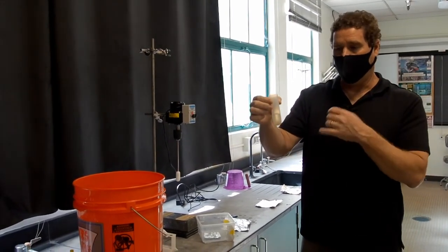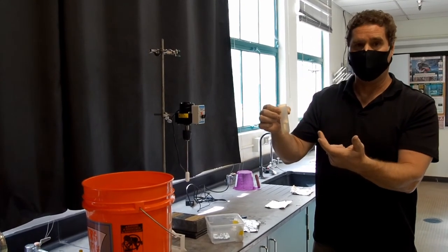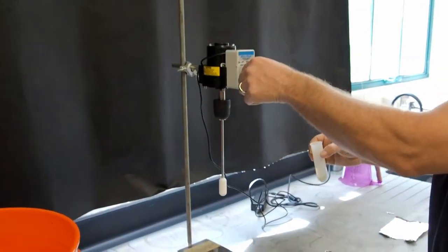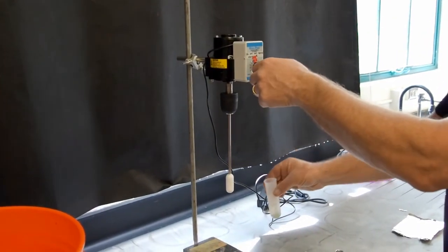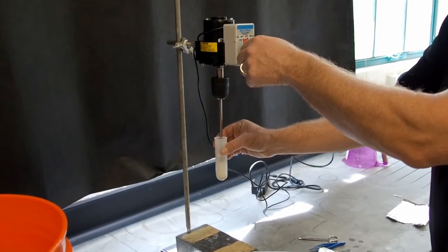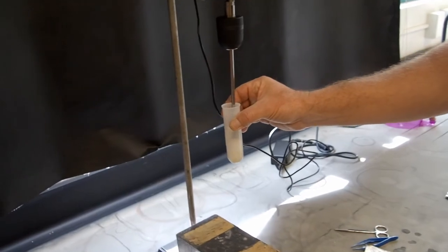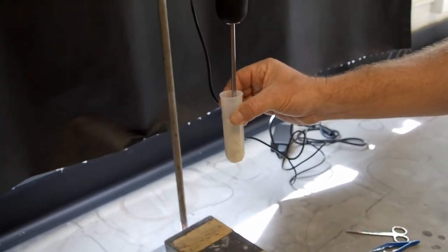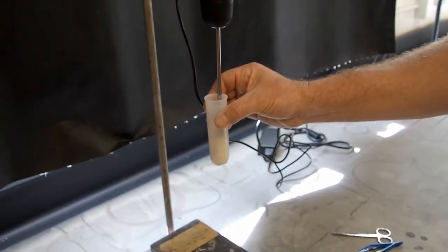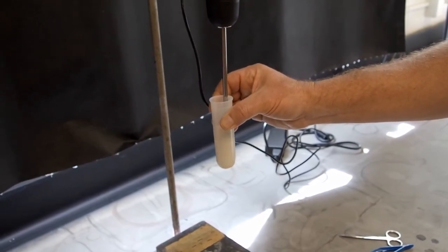We're going to want to pulverize this or mash this up so it's extracting even more effectively. To do this, I'm going to go over to this grinder. We're going to turn this on at a relatively slow speed. And all we do is put the tube into here and let this mash up these little bits of paper for a few minutes. So by moving the tube around and the walls of the tube against this grinder, we can basically pulverize the paper and better expose all of the phytoplankton cells to the acetone.